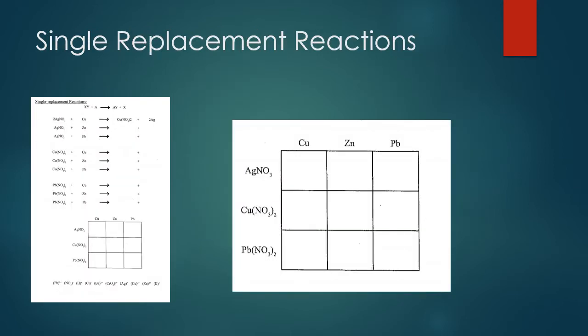So what we would do is go back to where silver 1 nitrate and copper is, and we would write what we see. So we saw a color change from colorless to light blue. You saw the copper, no longer coppery colored, but more of a blackish solid. So record those observations here.